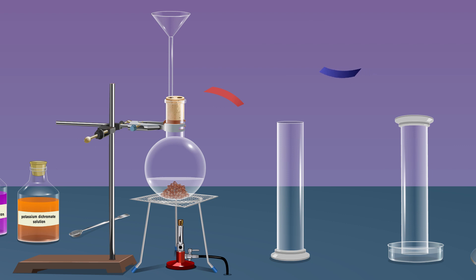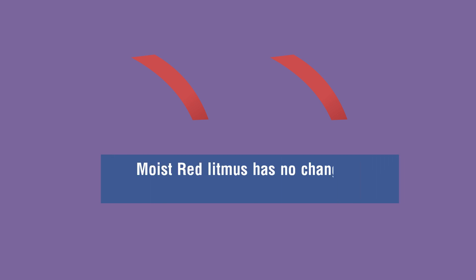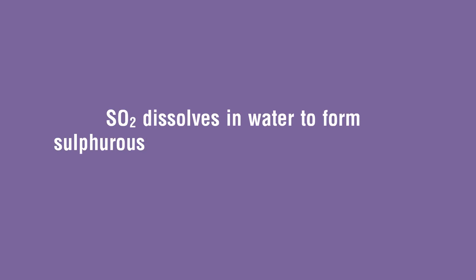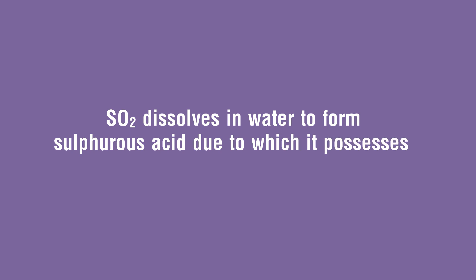Then dip the wet blue litmus paper into the gas jar. We observe a change in the colour of the blue litmus to red. Thus we confirm that sulfur dioxide is acidic. That is, SO₂ dissolves in water to form sulfurous acid, due to which it possesses an acidic character.